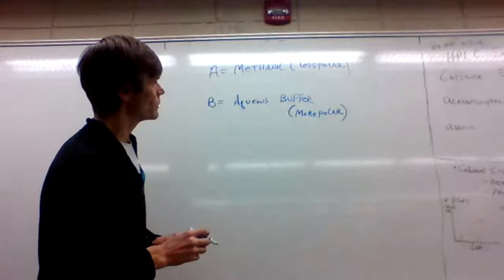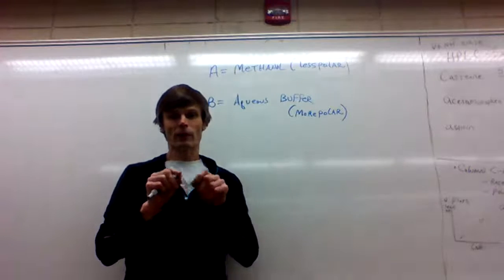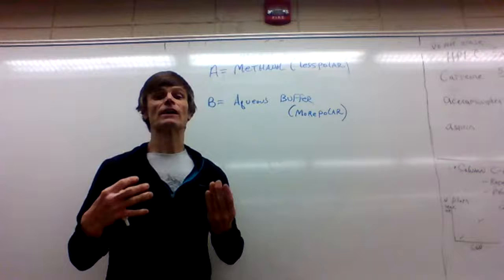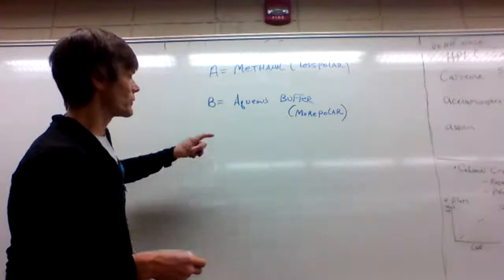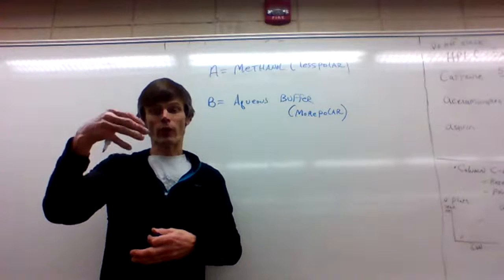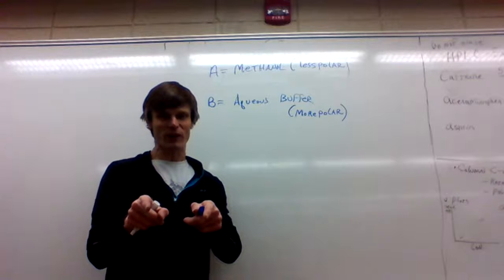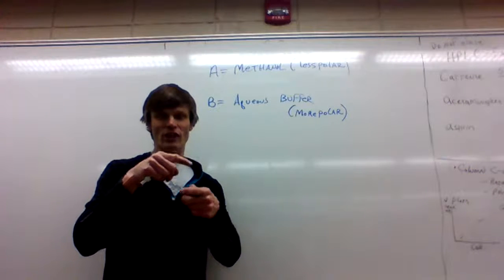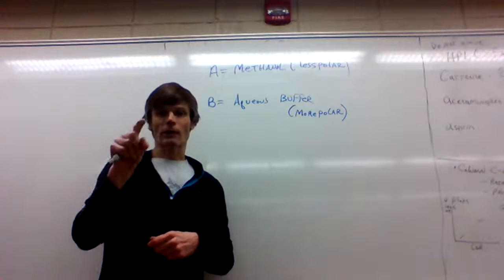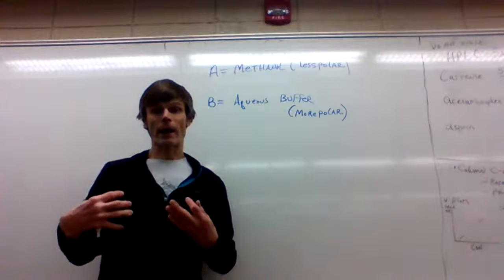And what we do is we combine these through our tubing to flow in at different rates. And that is a way we can control the percentage of our mobile phase in terms of, is it a more polar or is it a less polar mobile phase? Remember, we showed a few minutes ago, if we change the strength of our mobile phase, we could encourage different substances to come off at different times and speed up our analysis.